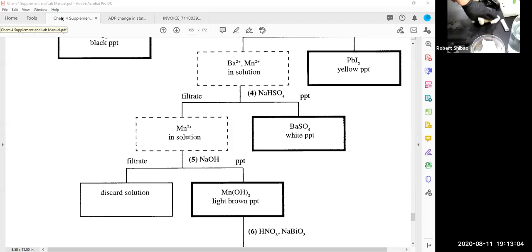That happens. So in Chem 1B, what I normally have the students do, and this is something I didn't do, I was just using the test tubes, is I normally have the students anneal the test tubes. I'm going to throw this into solid waste. So this is paper towel that's contaminated with PbI2, and I have a solid waste beaker here. I'll just put that in the solid waste here. And then I'm going to clean this up with some soap. Soapy water, paper towel. Let's move this out of the way.